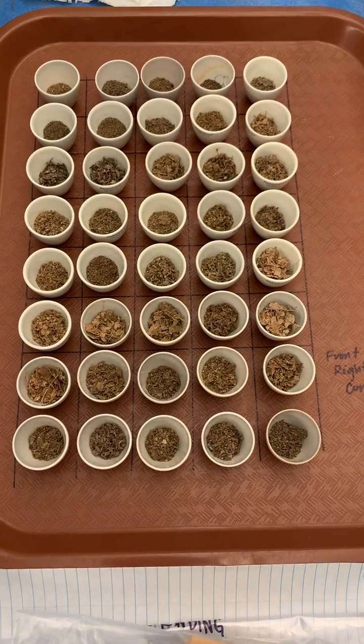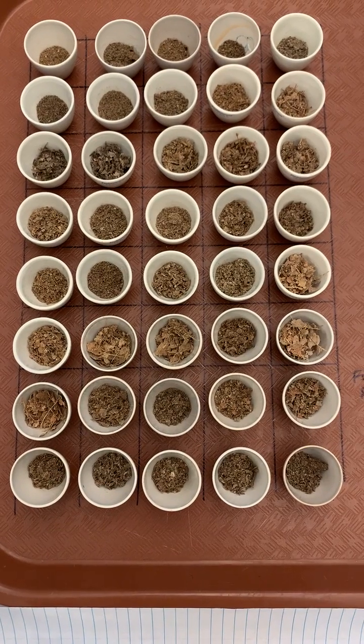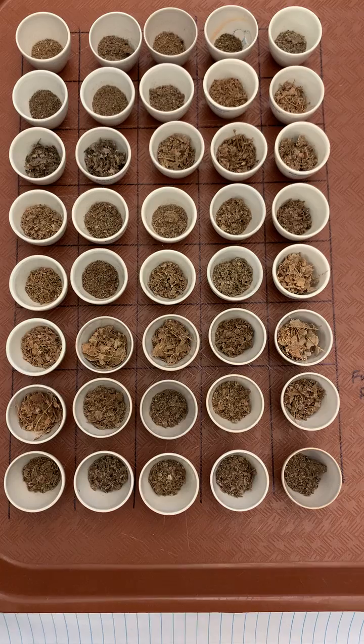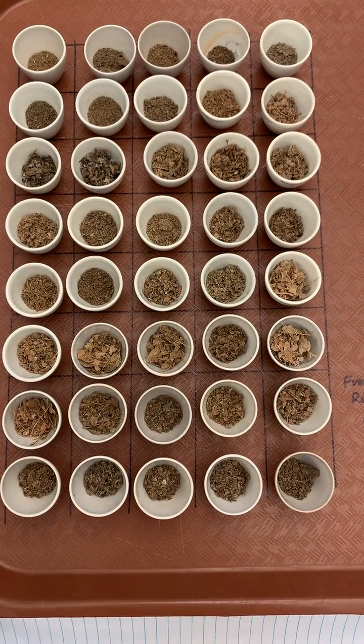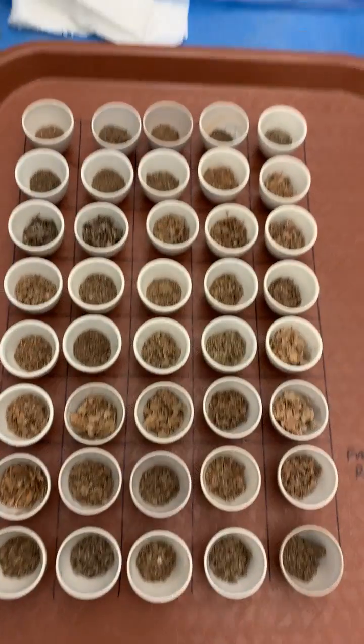To measure leaf litter decomposition, I take a subsample of each leaf litter bag and grind it up into a homogeneous mixture, and then weigh out a 0.25 gram subsample into a pre-combusted ceramic crucible.